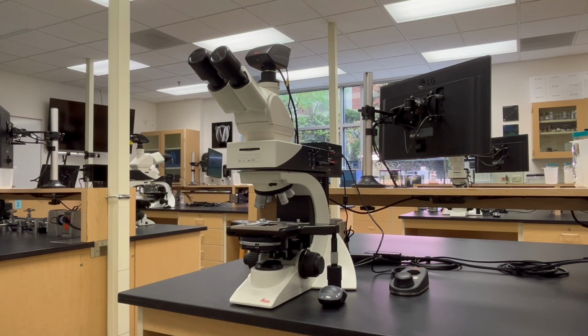The specific startup procedure for the Leica DM2500 microscope is dependent on which mode of microscopy you plan to utilize. In this tutorial, you will learn the step-by-step startup procedure for both transmitted and reflected light microscopy on the Leica DM2500 microscope.